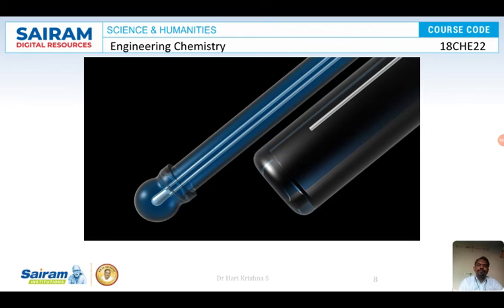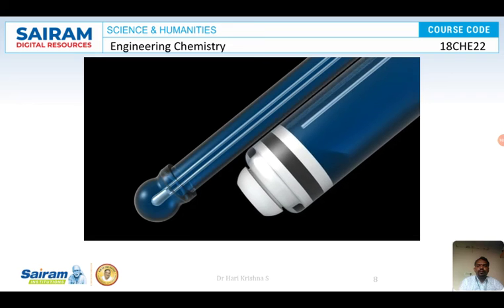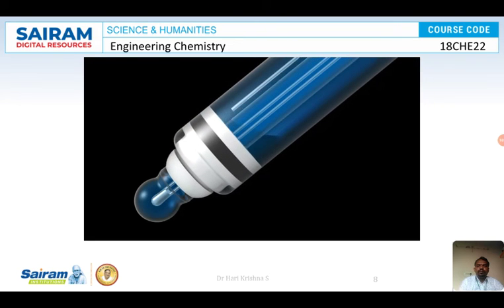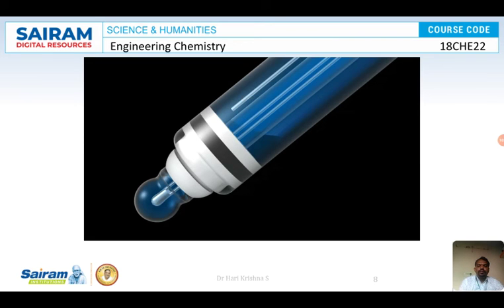The reference electrode, the reference system, is located in the outer glass tube and also consists of a silver-silver chloride wire in a potassium chloride solution. A so-called junction protects the reference system from the medium to be measured without disconnecting the electrical connection between them. The pH value is calculated from the potential difference between the reference system and the measuring system. Let's take a closer look at the pH-sensitive glass bulb to understand how this potential difference is formed.